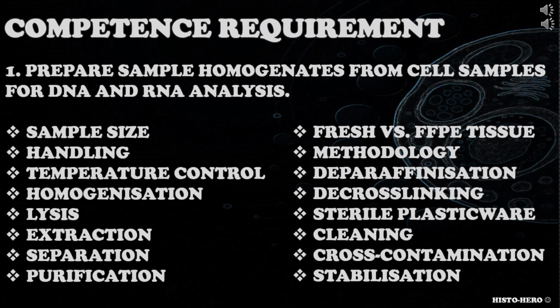What steps would you take and why? What problems could you encounter and how would you deal with them? Consider deparaffinization, rehydration, DNA extraction, RNA isolation, purification, amplification.